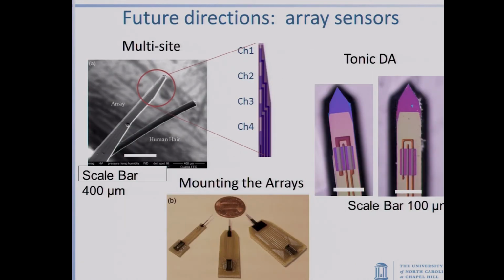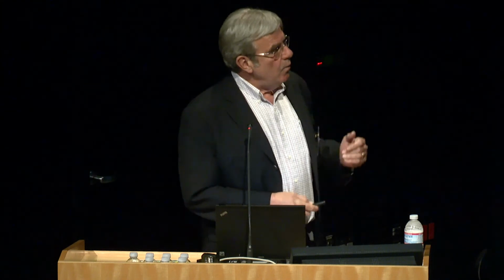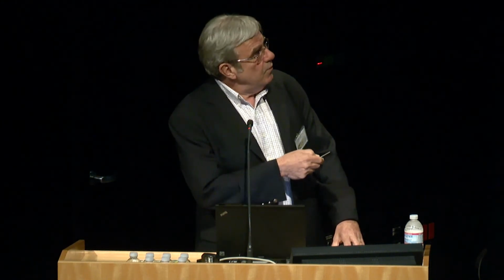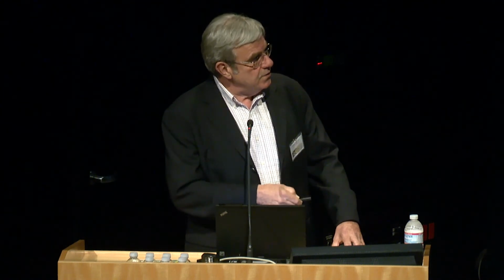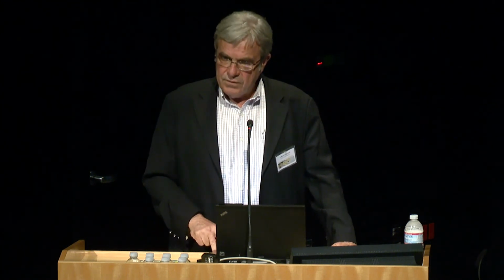The future. Well, there's lots of things that can be done in the future. One of the things that I would really like to see done is to get this into an array format. We have at one position 3 pieces of information, but we would love to know what's happening at other locations. So we have been working with Greg McCarty, who's a bioengineer at NC State, making various different kinds of sensors that will allow us to take this and find out what's happened in multiple situations. But that's a direction, as I say, for the future.